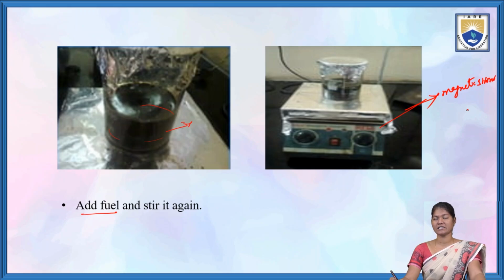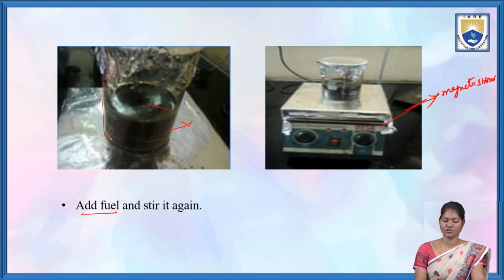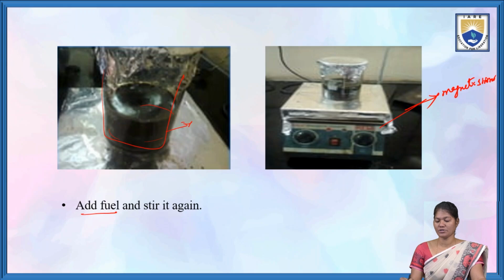We take the solution with the fuel added. When it is stirring with the magnetic pellet through the magnetic stirrer, the solution will be mixed up fine.